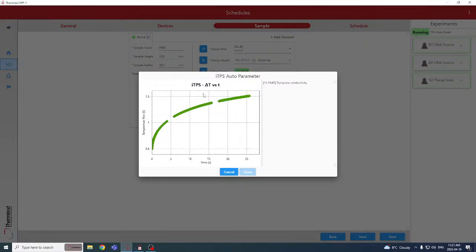So it'll extend out and measure past the boundaries on purpose to define the time that has the boundary, and then it'll select power and time based off of the available dimensions and the thermal diffusivity of the material, and recommend those to the user so that they can select those. So we're following all the ISO theory with this. That's really a critical part.